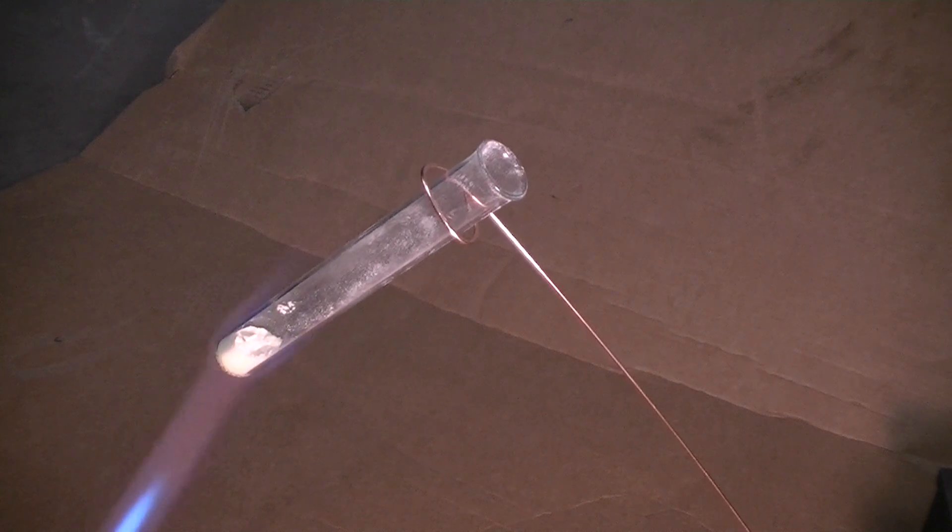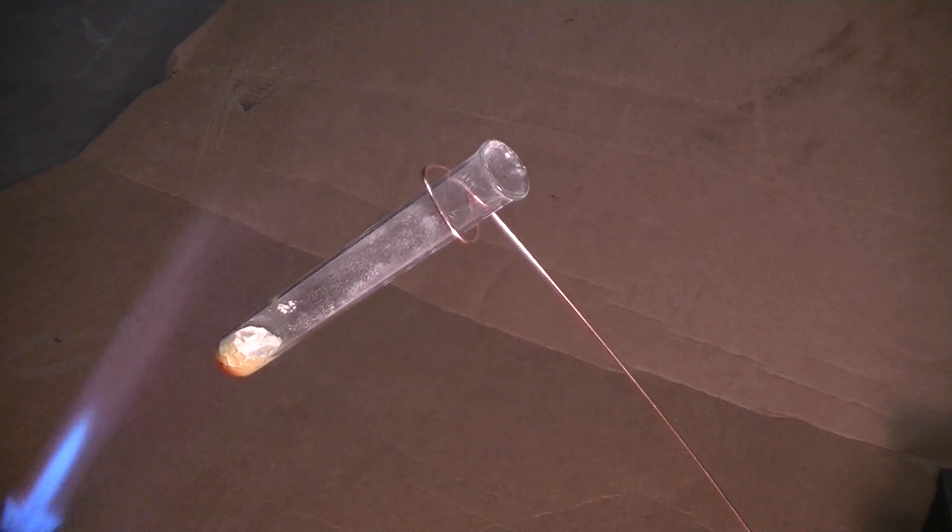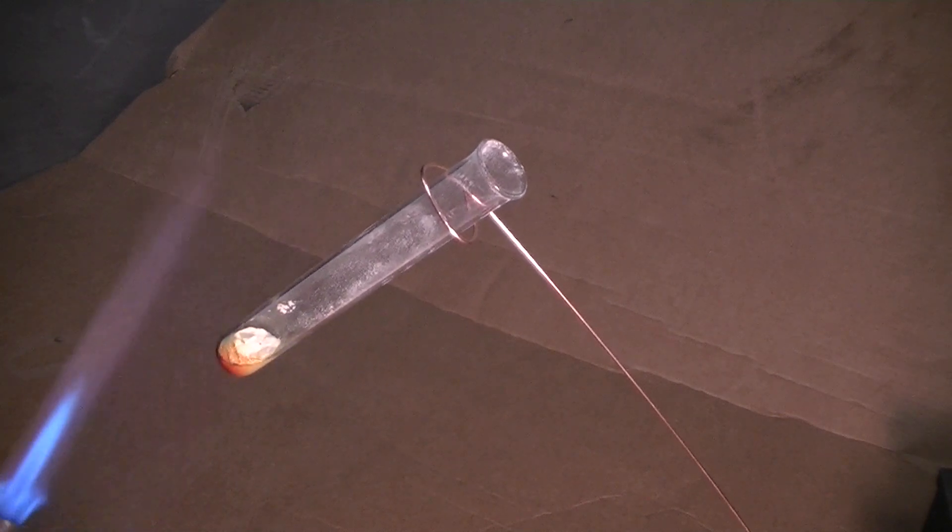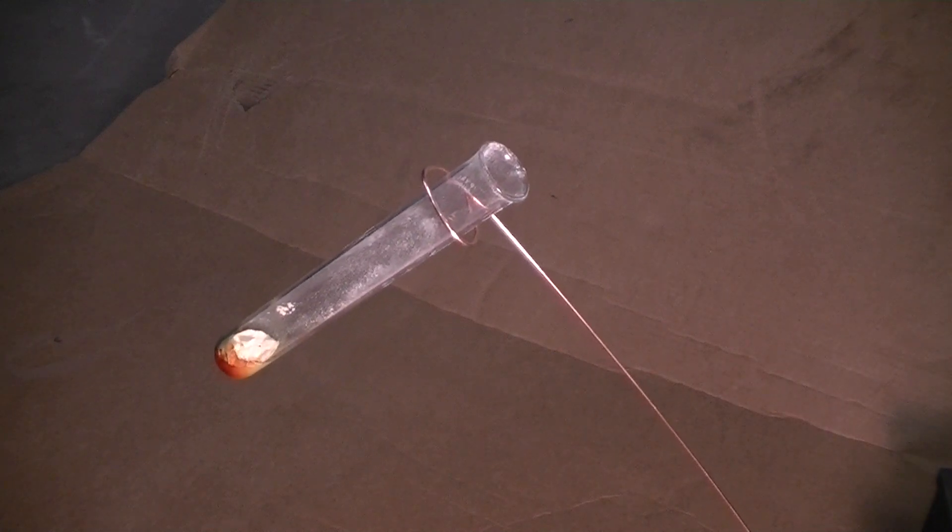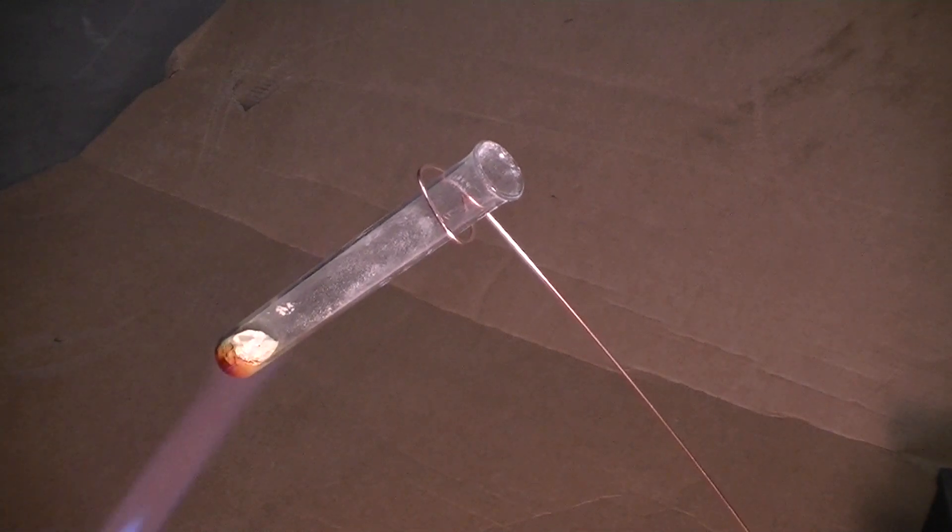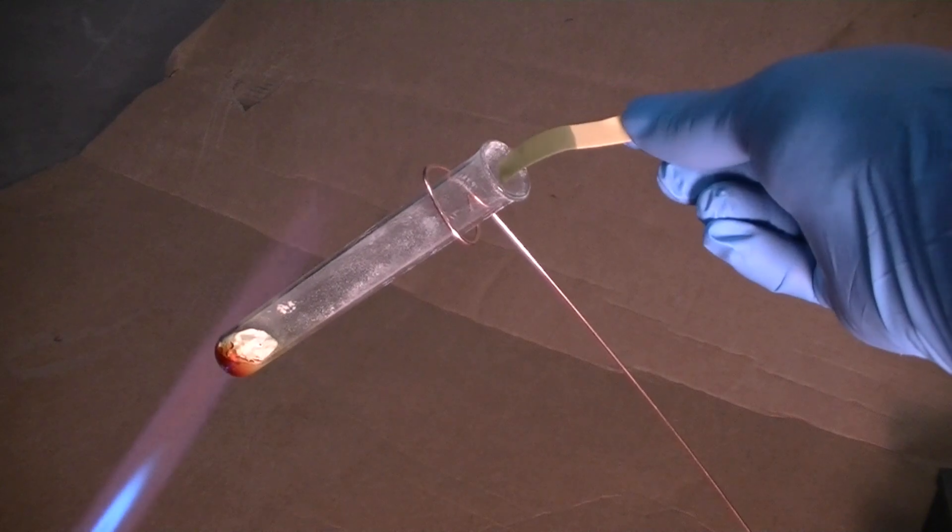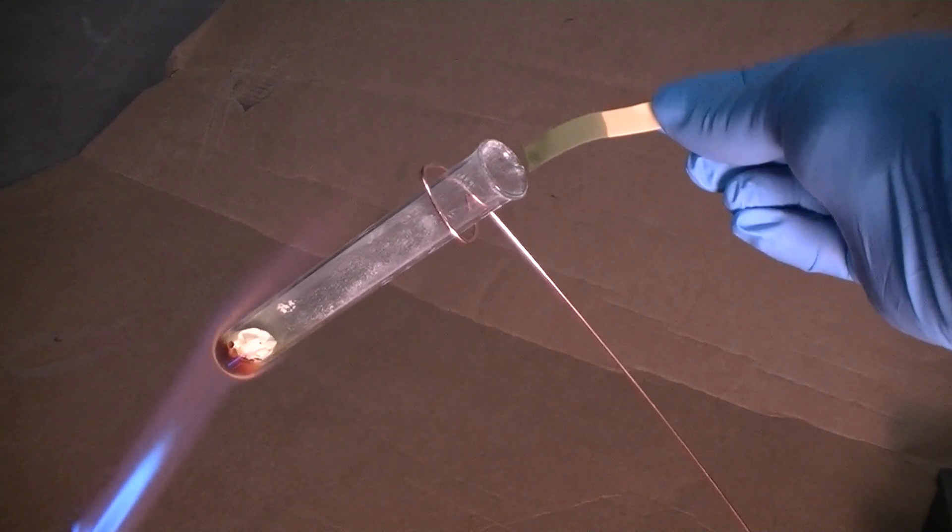In our second demonstration, to show the reactivity of some of that noxious sulfur dioxide and sulfur trioxide gas which is formed when sulfur is burnt in air, we have loaded a test tube with some sulfur powder which we are heating with a blow torch.